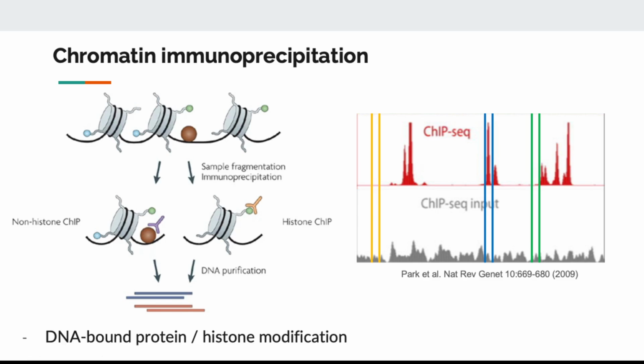So it's very convoluted, right? We target the protein that targets certain DNA so that we know which DNA pattern is recognized by that protein or by that nucleosome.